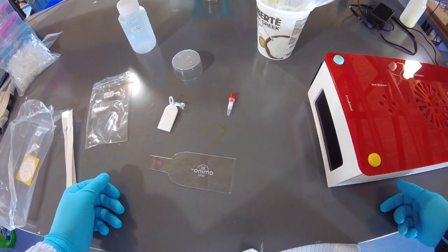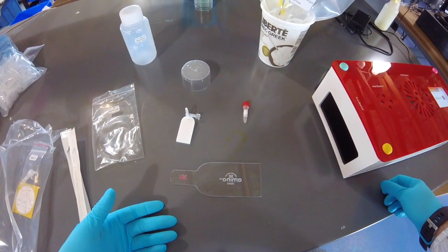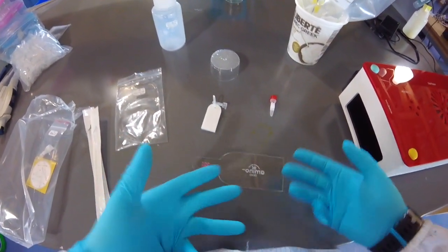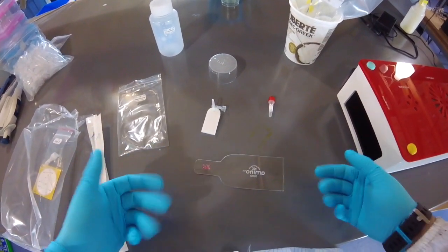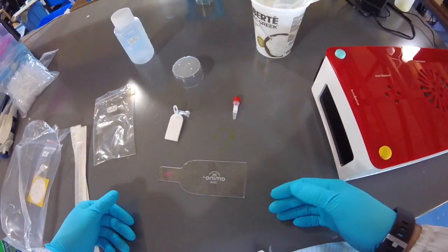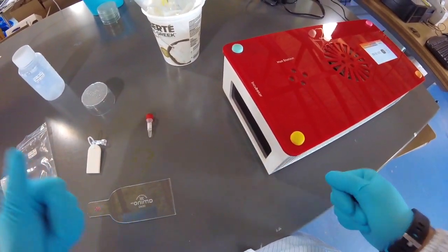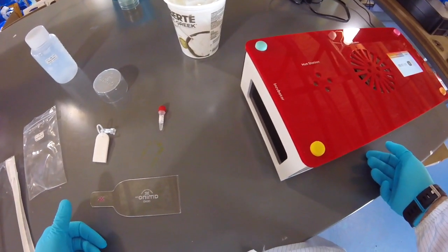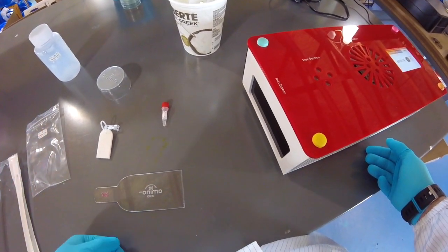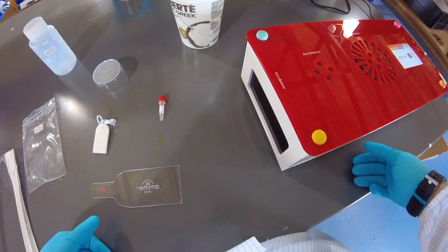The pace at which they grow is quite a bit slower than when you did the non-selective cells, because the non-selective cells didn't have any plasmids in them, so they weren't being asked to create something, like protein enzymes or colorful proteins, which can take some extra energy from the cell's normal metabolism. And then two, the antibiotics do slow the growth of the cells as well. So because these cells are now growing on antibiotic-containing plates, they will just grow slower, period, because there's this battle going on between their defensive forces, namely the selection marker protein enzyme that you've engineered into them, and all of the antibiotics in the LB agar that you added on the first day.